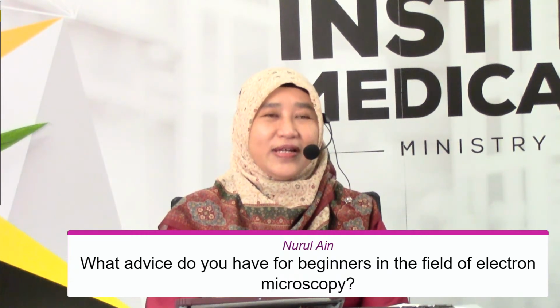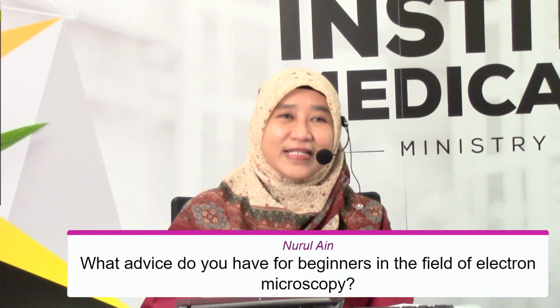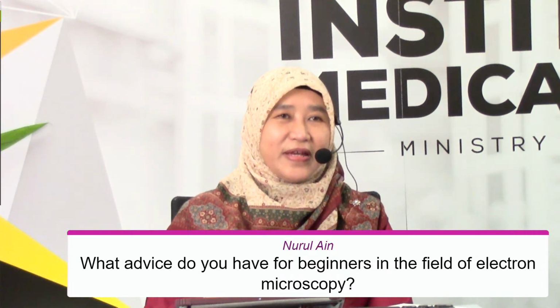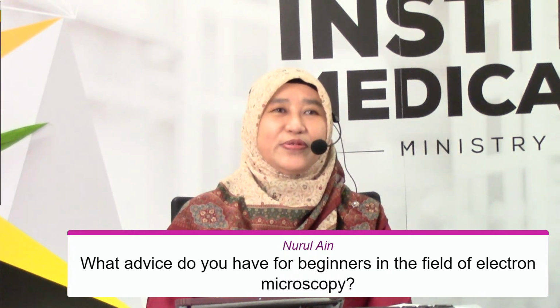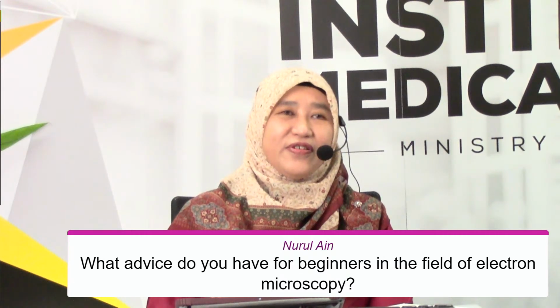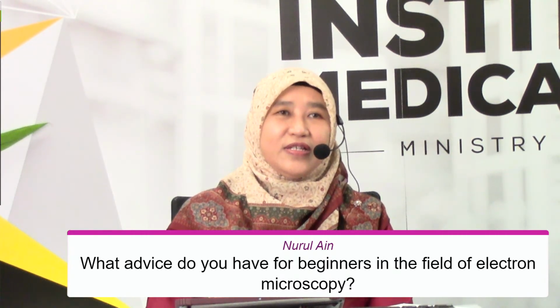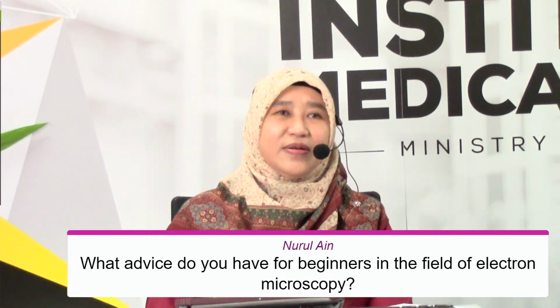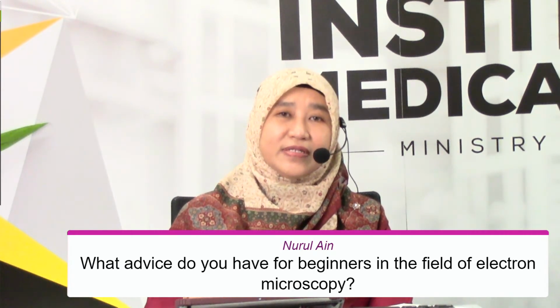Okay, what advice? I will take myself as an example. In order for you to get involved with this EM technology, you must understand very well the processing part of the samples, every step of the processing.